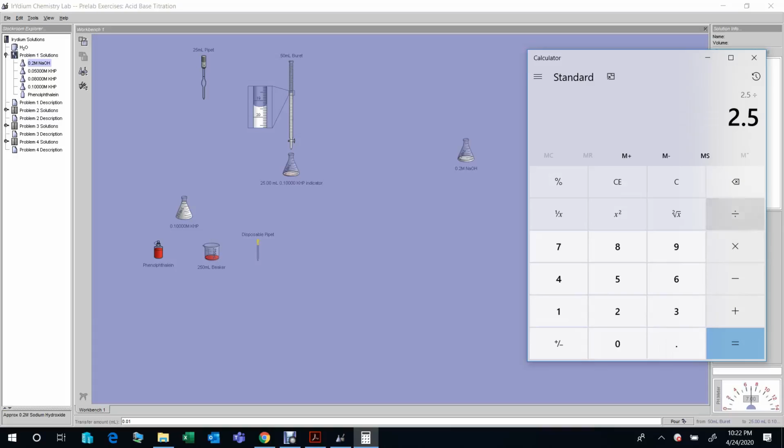And then we divide it by 12.51 milliliter. We can convert the milliliter to liter, but here we don't need to convert because these two milliliter units will cancel each other. And then we end up with the unit as molar. So here you see that is the exact concentration.